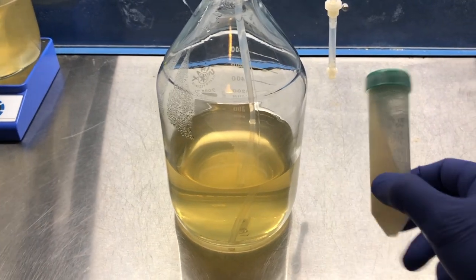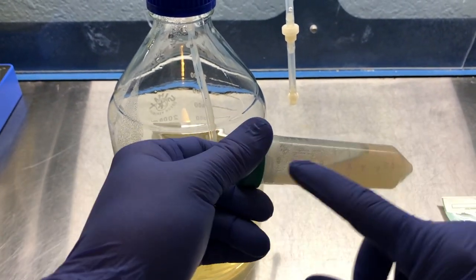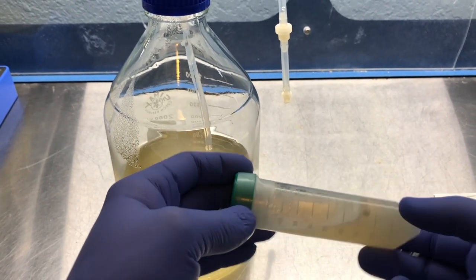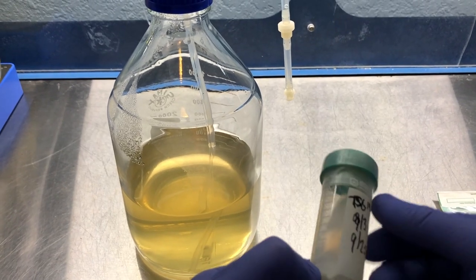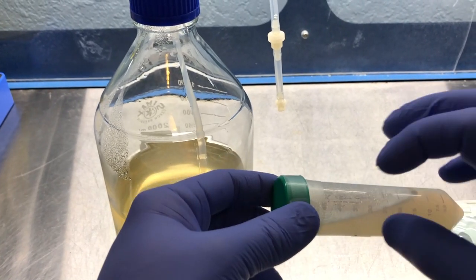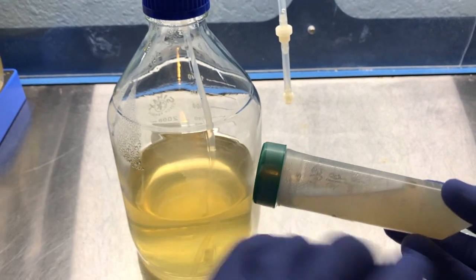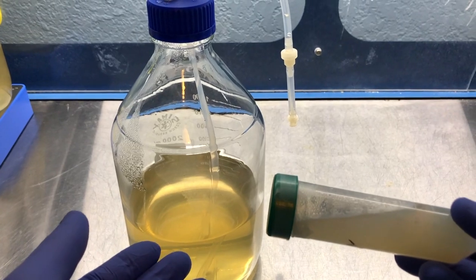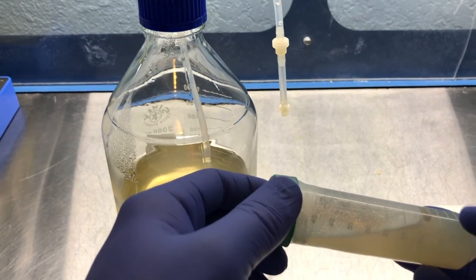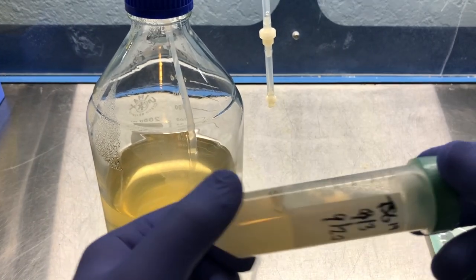Alright, so I've got my cordyceps culture slant right here. You can see how healthy that mycelium is. One important factor when you're observing cordyceps mycelium is that you want to make sure that it's still kind of white. One of the signs that it's degrading is that the mycelium will start to turn orange or yellow. When you grow the cordyceps, any exposure to light for 24 to 72 hours is going to cause that mycelium to turn yellow.